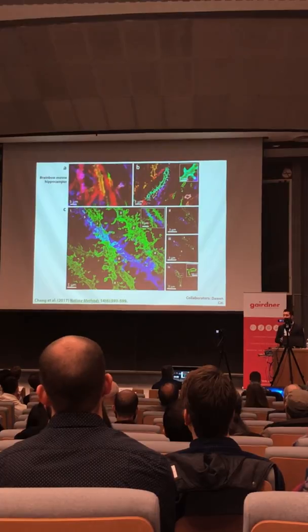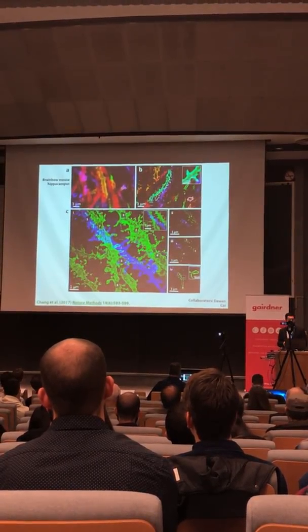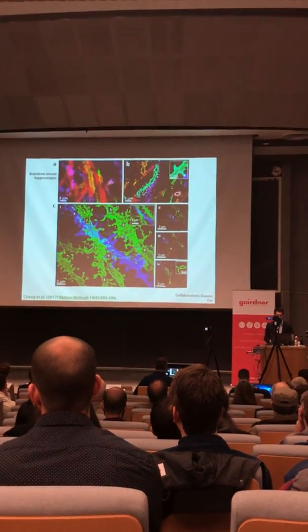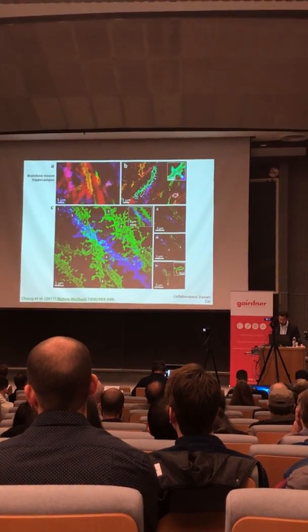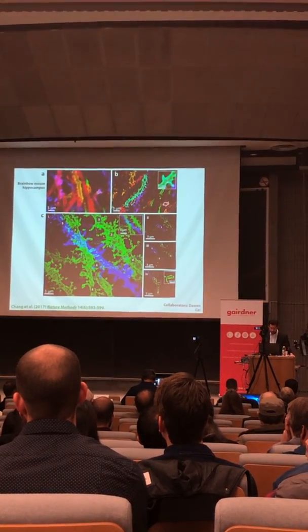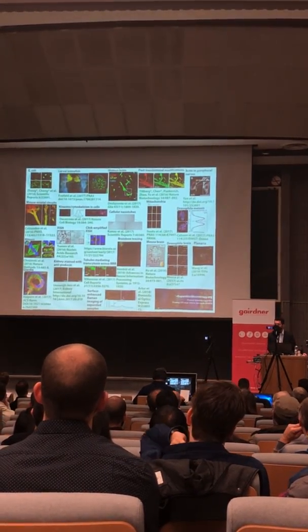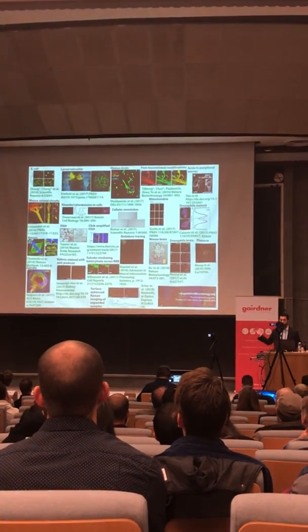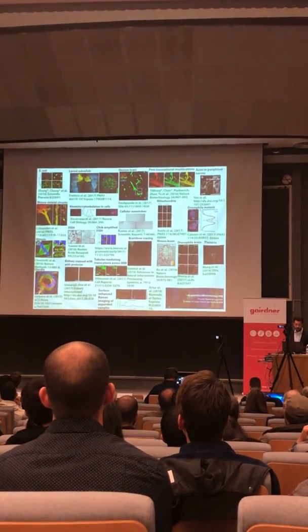And so we're working now to validate this by expanding lots of different objects that have known properties, such as viruses and other kinds of ground truth, understandable biological systems where the components are well known and well understood. Expansion is really taking off. We've seen it applied to all sorts of different critters, bacteria in the upper left, Giardia parasites in the lower left, and right now the kinds of discoveries people are making are coming along at a rapid clip.